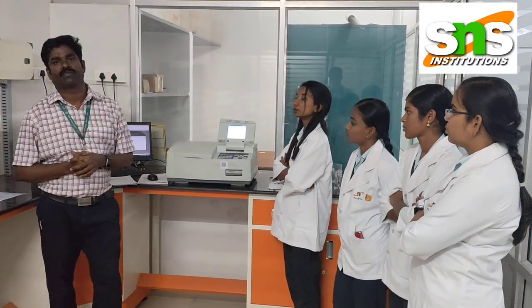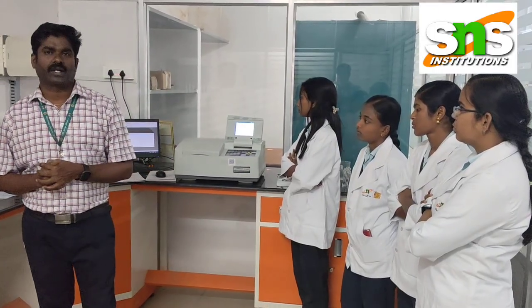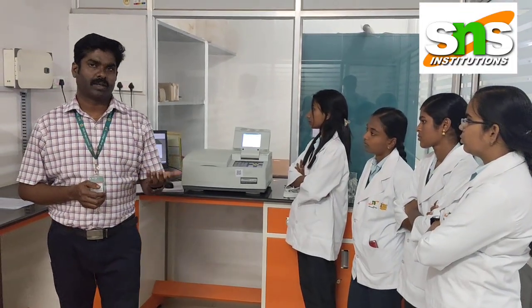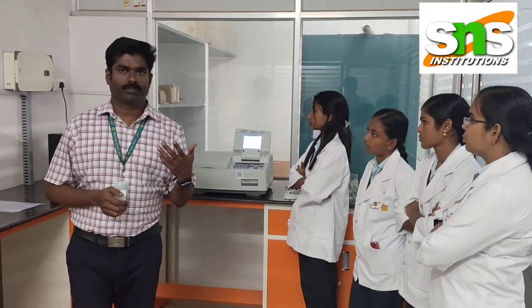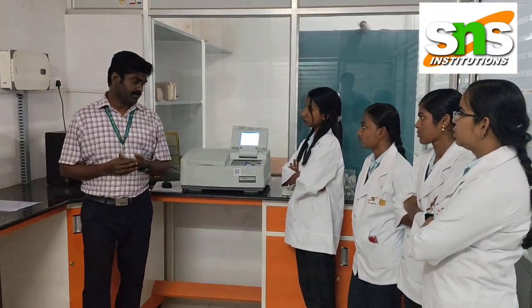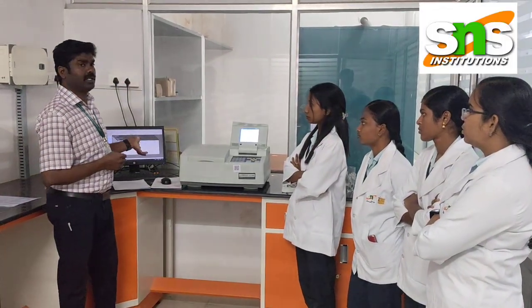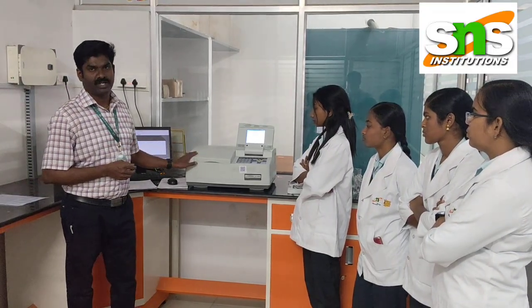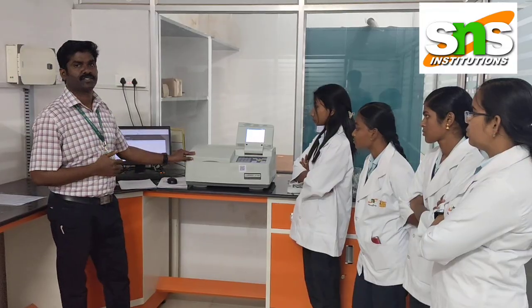Through absorbance, we can find out the concentration. Through concentration and the dilution factor, we can find out the percentage purity or amount present in a given formulation, marketed brands, API, bulk product or finished product. Here we are using a Lab India make UV, which is a highly sophisticated instrument.